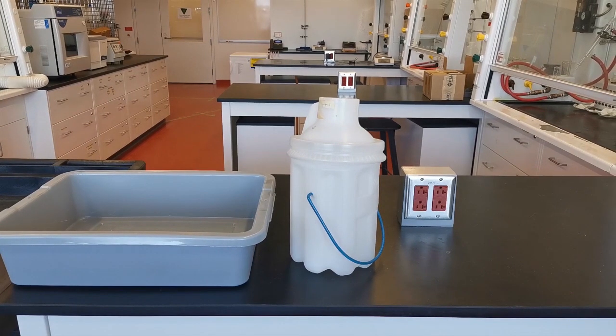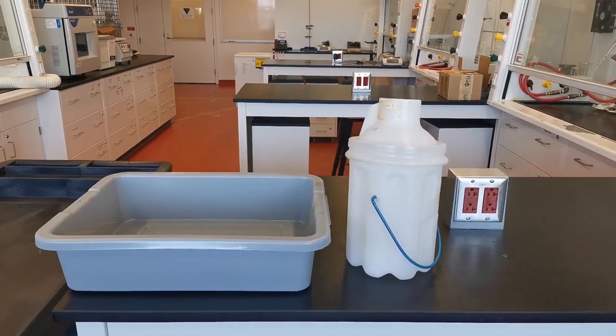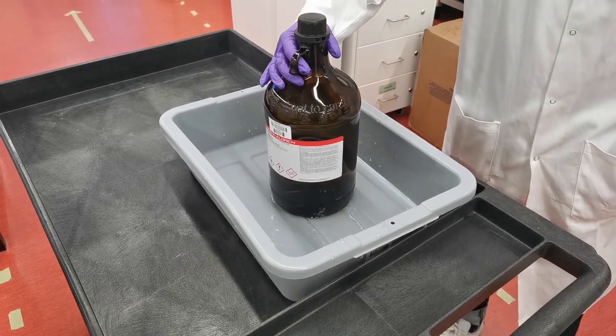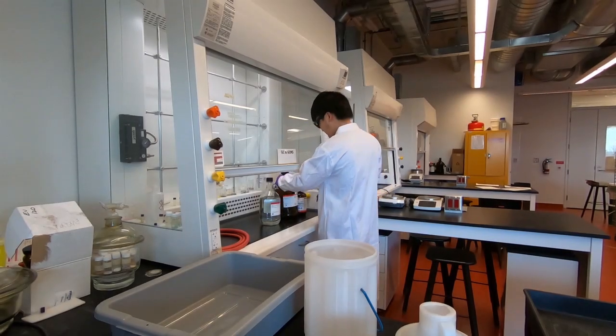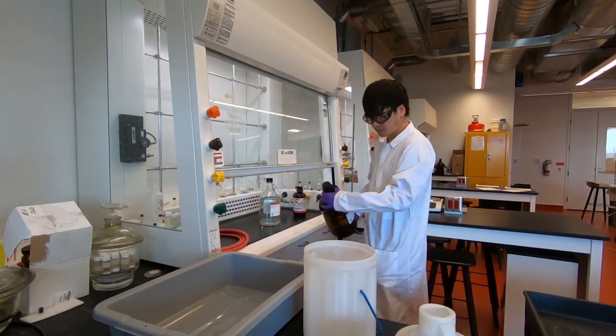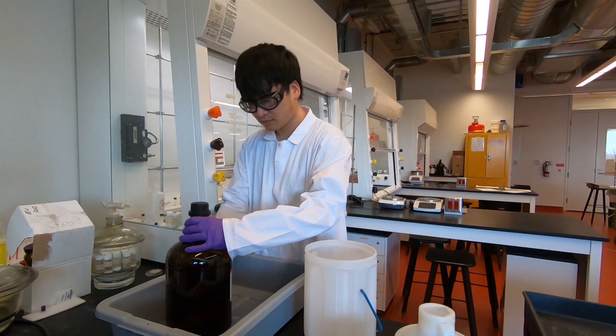Ensure that the size of the tray will contain all of the materials being transported and that the materials are compatible with each other and the tray. If the primary container fails, the secondary container should be able to hold the contents and prevent a spill. Now, you are ready to transport your chemicals.